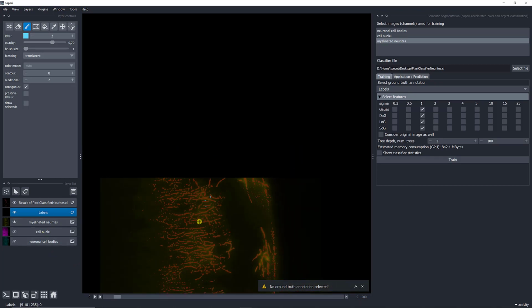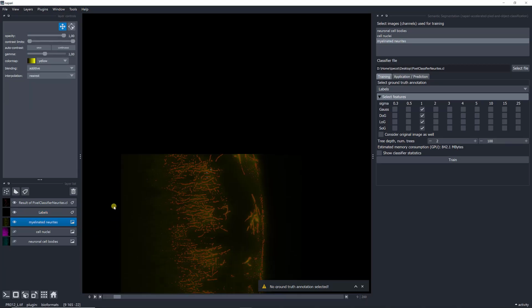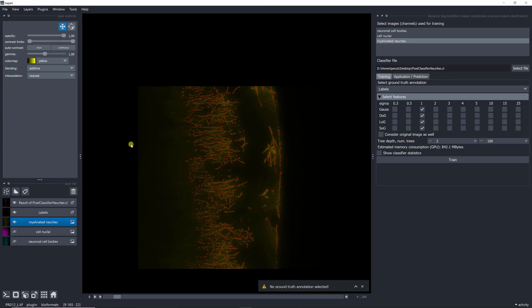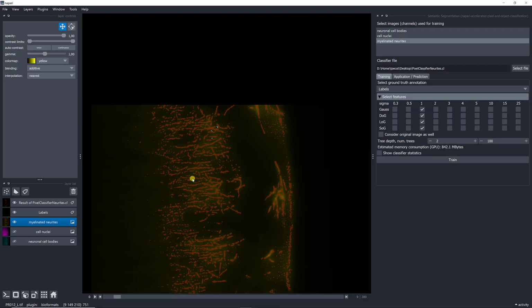And boom. And so here you see, okay, let me just select this so I can move it. As I fit the classifier with some examples, I can remove this, not useful anymore. With examples in between structures, now it does a better job at identifying individual structures. The problem is that we have a lot of noise. So I'm going to try to improve this. I'm going to add more examples, and I'll be back with results that seem more reasonable.